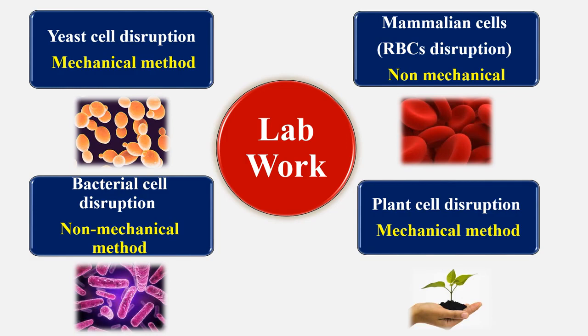Lab work for this lab is using 4 different disruption methods to disrupt 4 different cells: yeast cells, mammalian cells, plant cells, and bacterial cells.